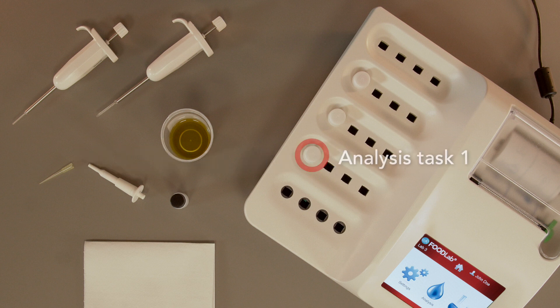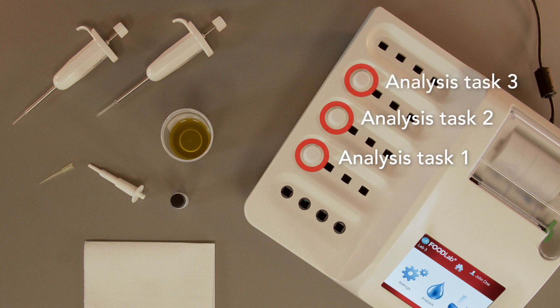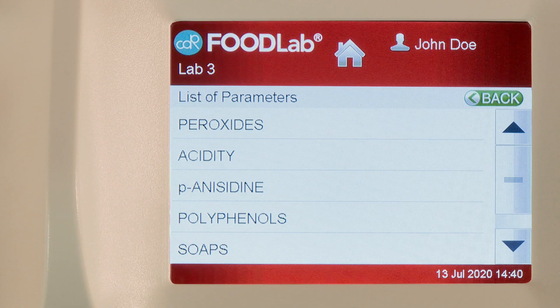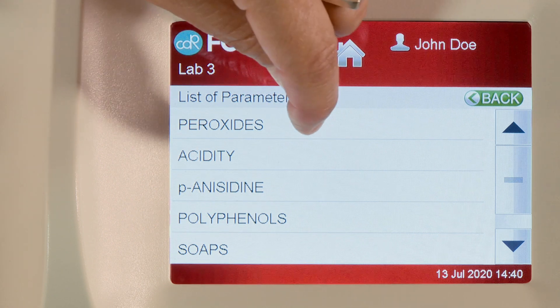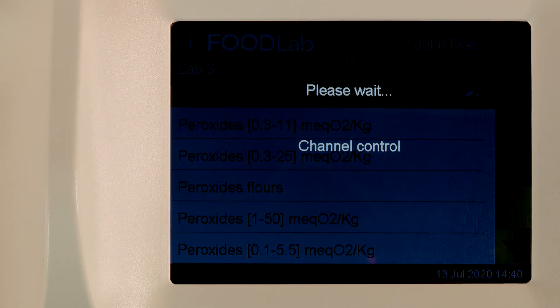For ease of use, place the R1 test tubes taking care to memorize the position of each reagent. Select the first analysis from the menu.